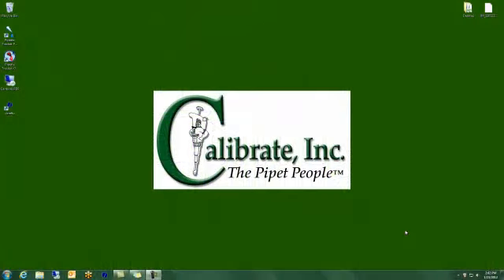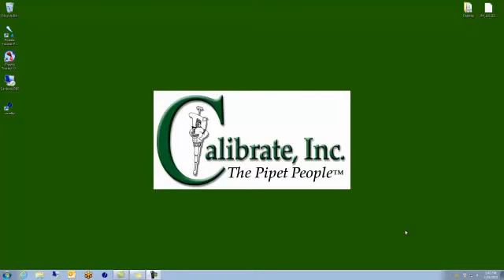The purpose of this training video is to explain the Pipette Tracker Pro Sync Utility and how to use it. Think of the corporate server as a library where you will check out a copy of the Pipette Tracker Pro program before using it. Once you have checked out your copy, you can then make changes to it, and then you will re-upload and return your copy to the library, or the corporate server.